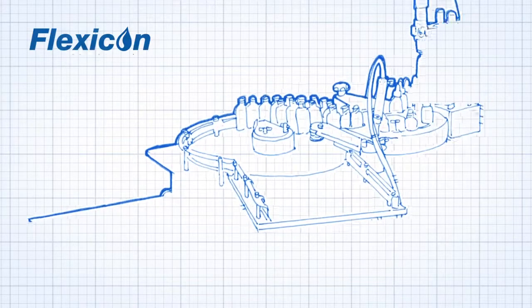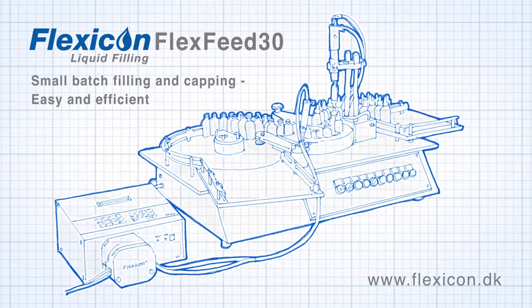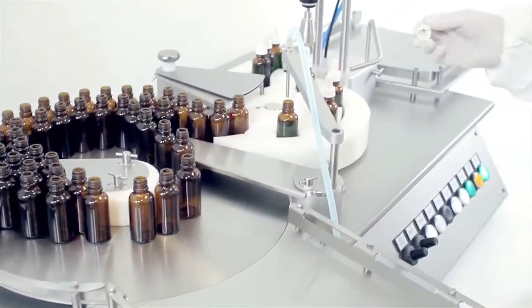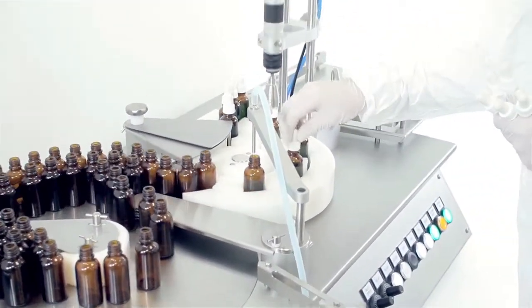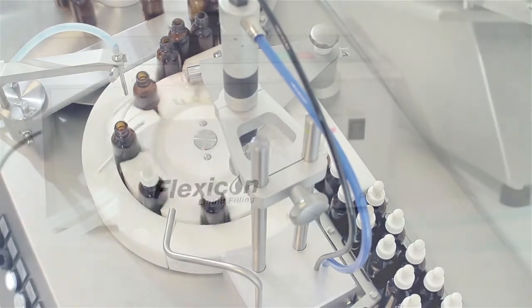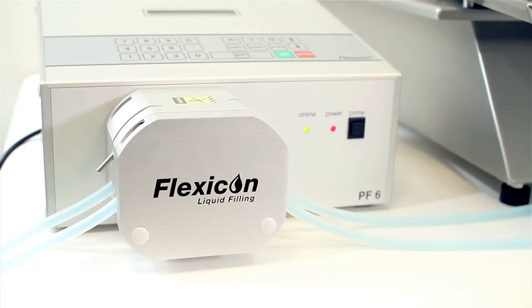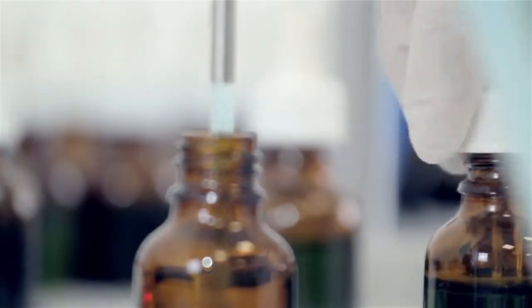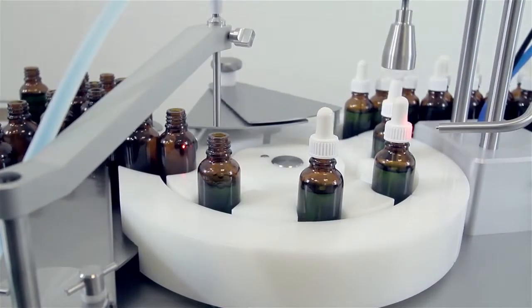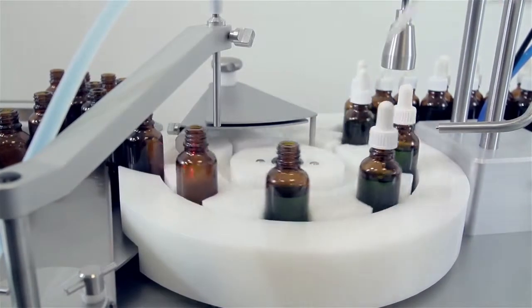The FlexFeed 30 is a tabletop bottle handling and capping machine that provides consistent cap torques, reduces operator repetitive strain injuries, and is ideal for small-scale production. Combined with the Flexicon peristaltic filler, the FlexFeed 30 is a universal solution for filling and capping up to 1,200 bottles per hour with diameters from 12 to 50mm.